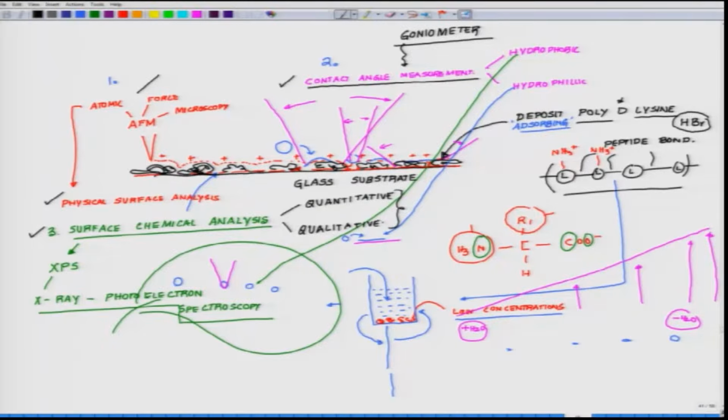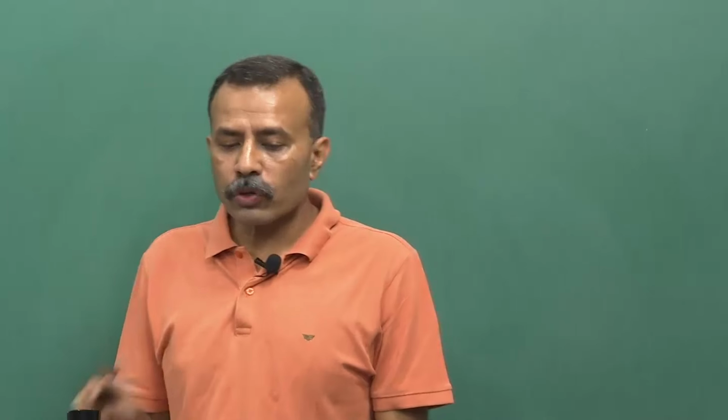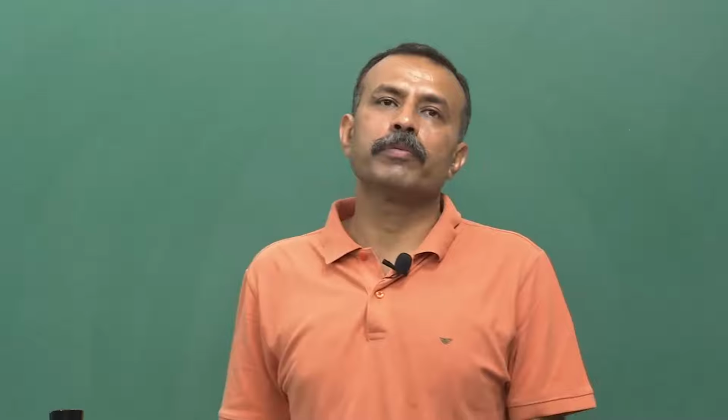So once you know the tools to analyze a surface, you know how much power you have to approach a problem. Now I give you any material, irrespective of whether you know the nature or not. I may give you even a random stuff. I say, this is going to work. How should you scientifically proceed, experimental science wise?